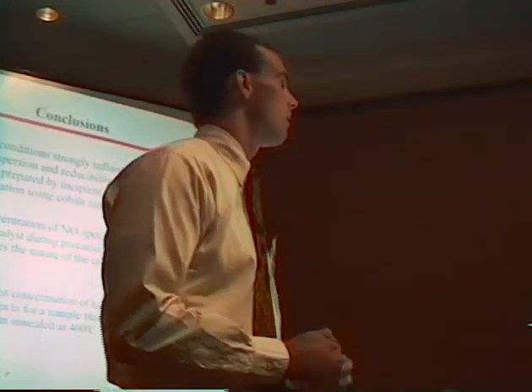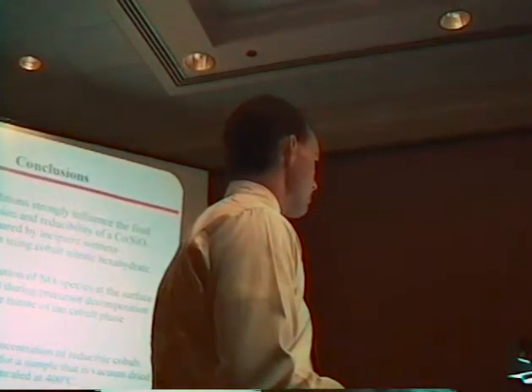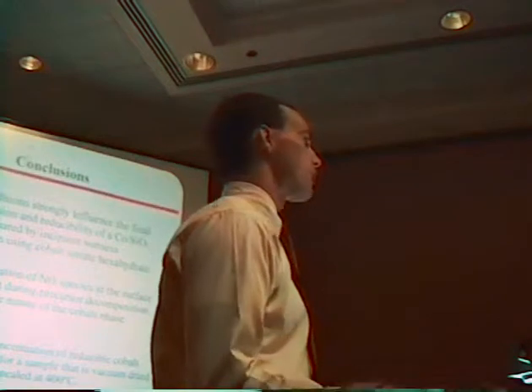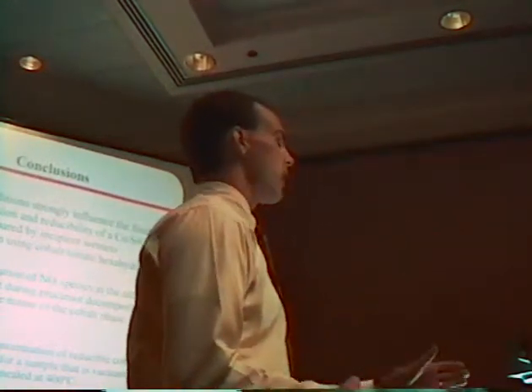Yeah, Norman? I don't know, what do you have in mind for NOx? I mean, if somebody showed me a spectrum with a band at 1380 and they said it's NOx, I'd say it's NO3, it's not NO2. I'm basing that reference on a paper that came out, I believe in Thermochimica Acta by Mansur, where they looked at cobalt nitrate hexahydrate decomposition.